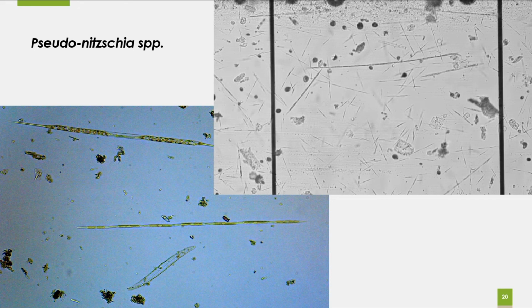I think once you see them next to each other, it's pretty obvious, or maybe it's not, I don't know. But there are a lot more chloroplasts here. It's a lot more elongated, and you can see these very pronounced pointed ends, which I can show you another image of, but it's very different looking than Pseudo-nitzschia in a lot of ways. But this is a large cell Pseudo-nitzschia, and you can see the chloroplasts on either side and the little clear circle center, the nucleus. You can see them overlapping. This looks like the valve view. You don't see that stair-step overlap, but they're on top of each other.